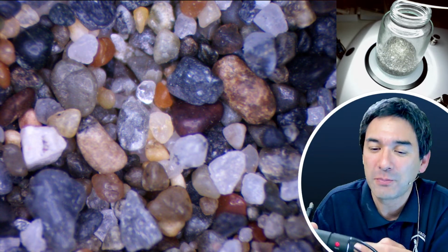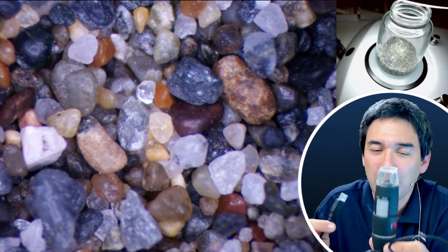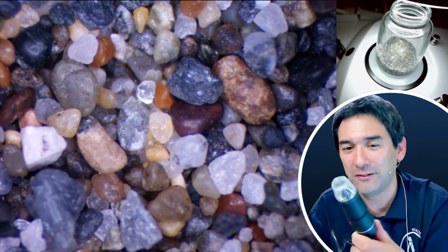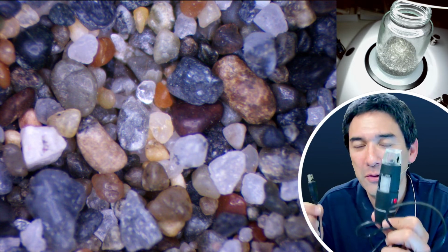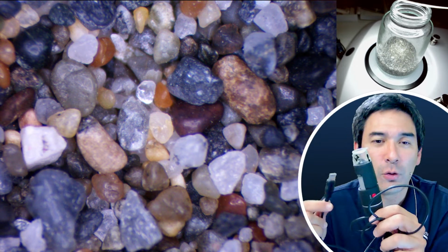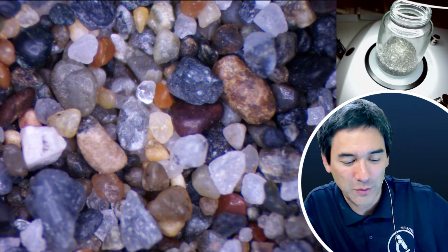I'm a little bit surprised by the price difference that some of these things have. But this one really was extremely cheap, really less than 10 euros or dollars or something like that. So I just got the cheapest one I could find simply to try it out. I recommend those things if you want to have something fun to play around with, but do not want to spend too much money.